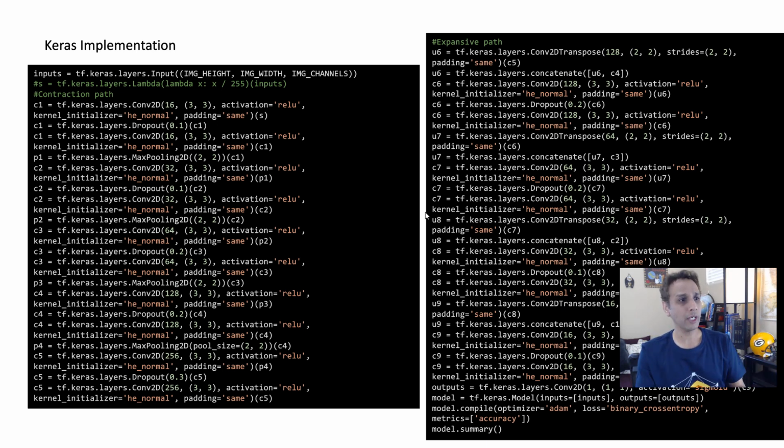Okay, so this is how you write this in Keras. There are numerous implementations of these online. Go ahead and copy someone else's code if they have already written something like this, or just get mine, right? I mean, the link is down below.